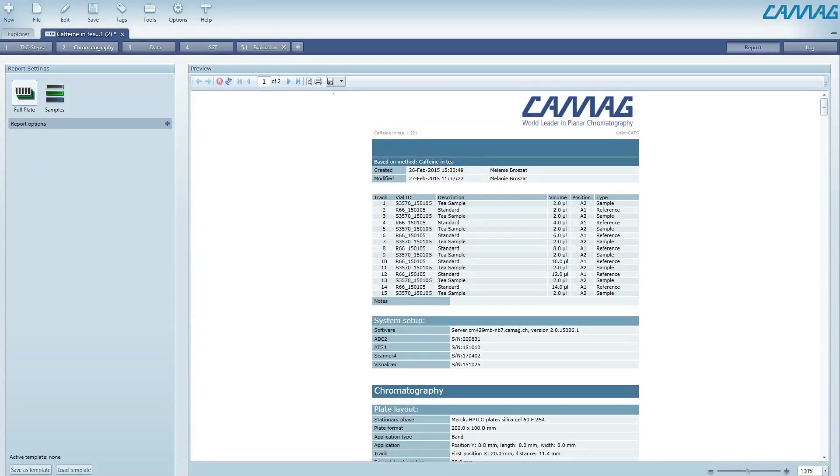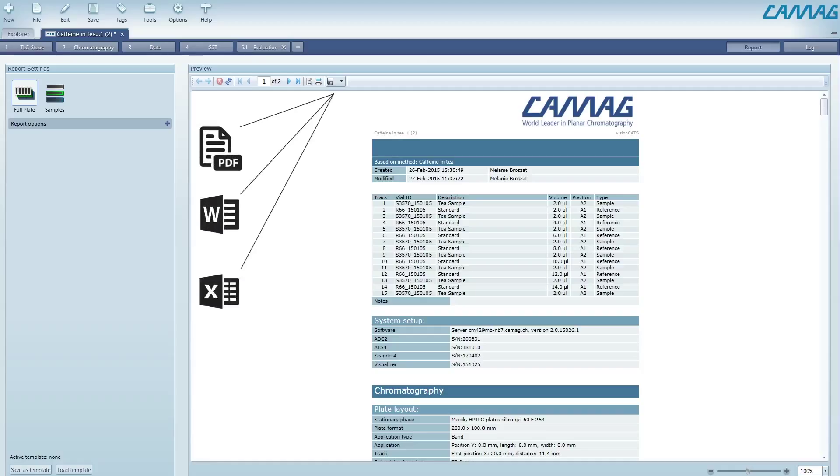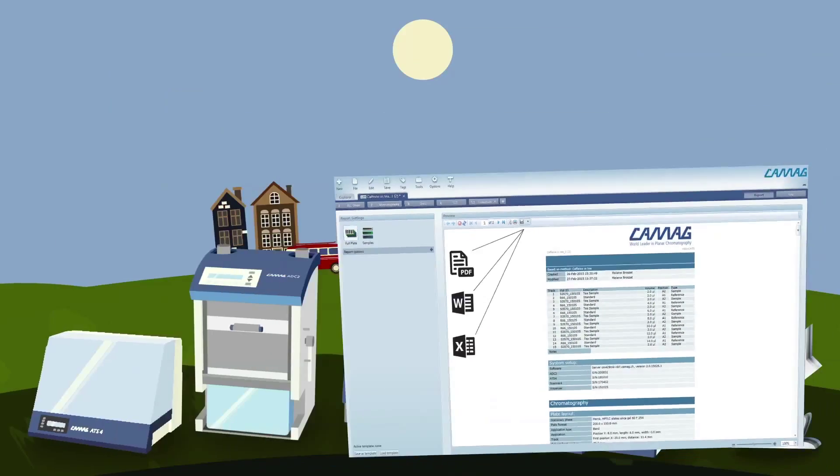After your HPTLC evaluation, simply export your report as a PDF, Word, or Excel file.